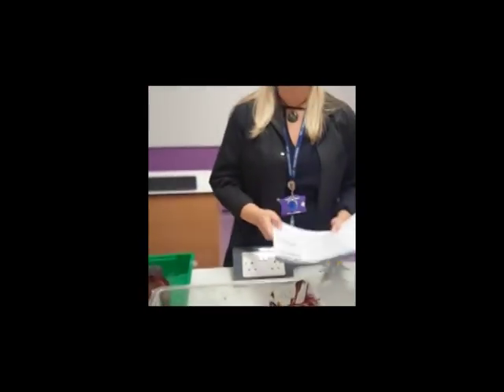We've got quite a few of these wood lice and we're going to use them in the next core practical — the P8 core practical you need to do. It's the CBHD core practical about respiration rates. Scientists carry out experiments to find out how respiration is affected by different factors such as space travel. They measure respiration using a respirometer, which measures the amount of oxygen used, the amount of carbon dioxide produced, or both.